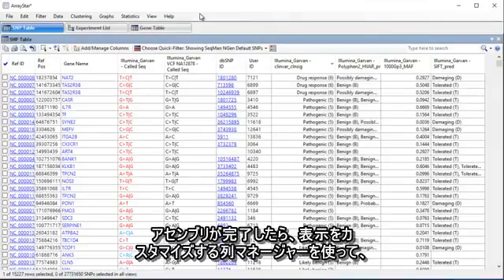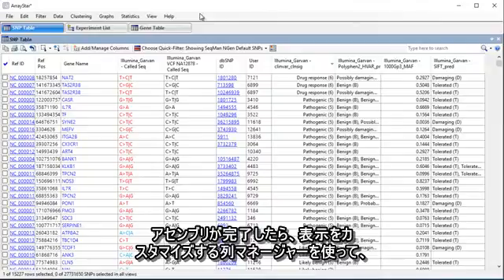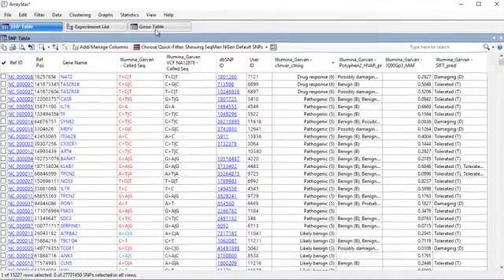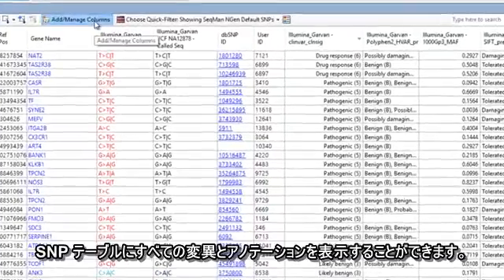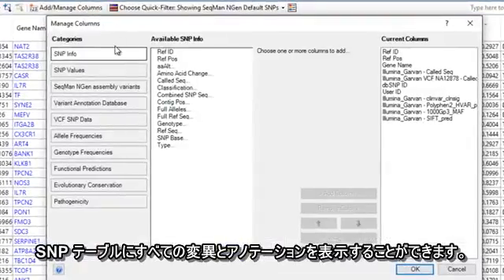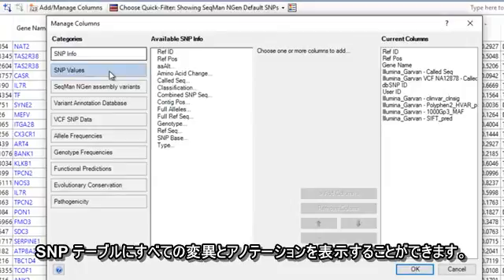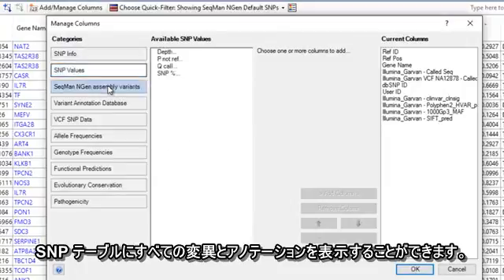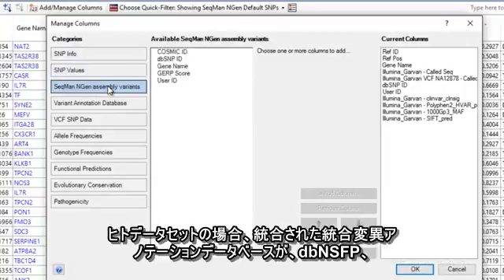After assembly, you can view all variants and annotations in the SNP table, using our column manager to customize the display.